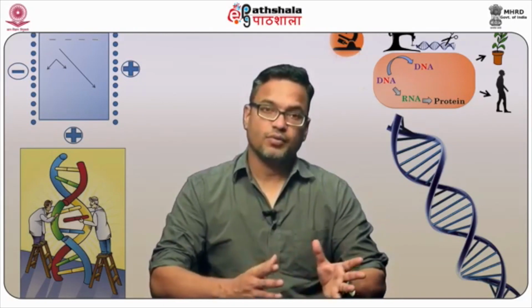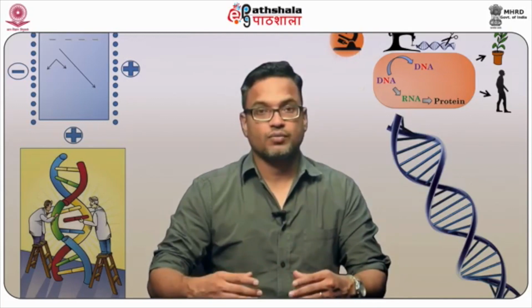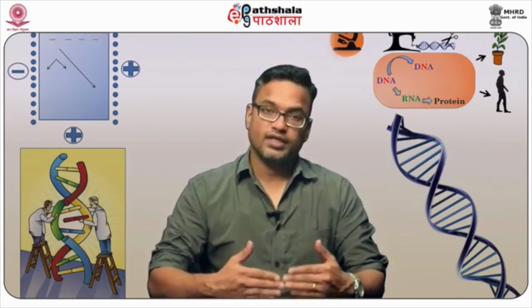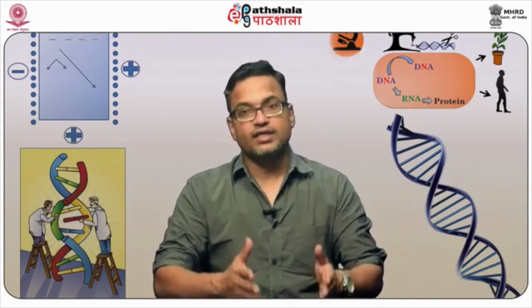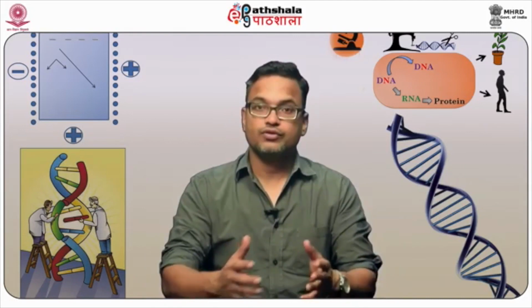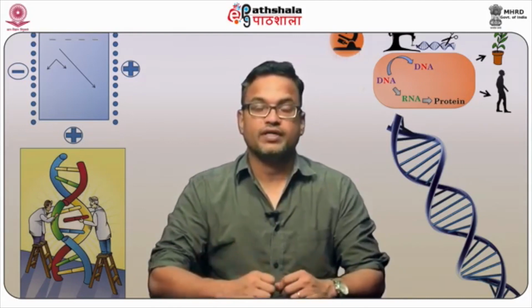Unlike light microscopy, where white light is used, which has all the wavelengths available, in fluorescent based microscopy we split that white light into the specific wavelength we are interested in, use that wavelength to excite our molecule of interest, and then view it when it emits light on returning to its ground state.